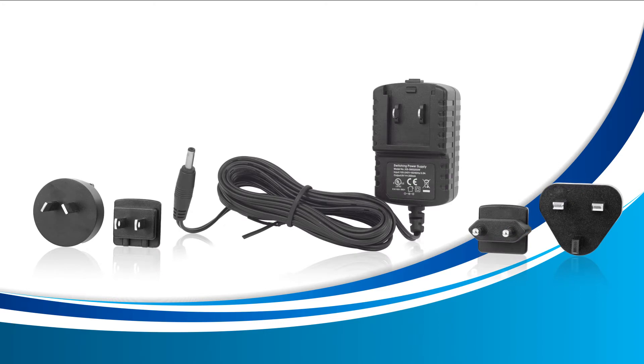The AC adapter included with your thermometer is meant to be the main source of power for your device. Be sure to always have your device connected to its AC adapter, as the batteries in your device are only meant to be used as a backup power source.